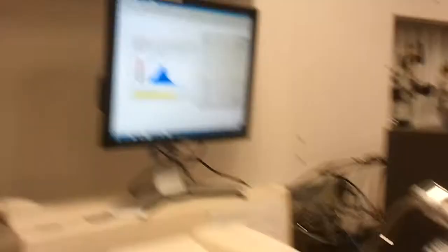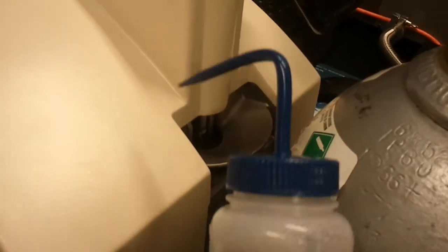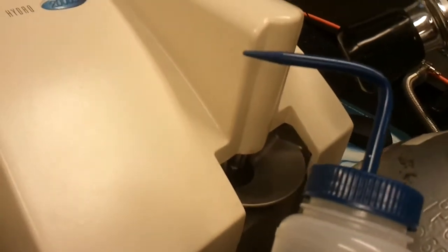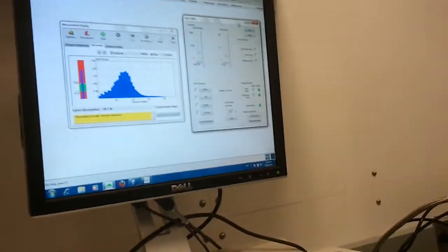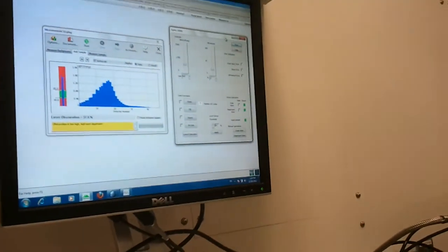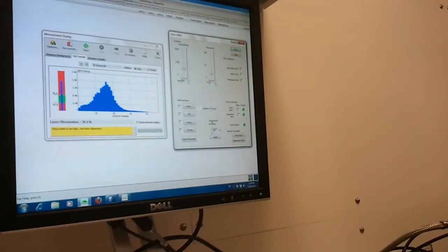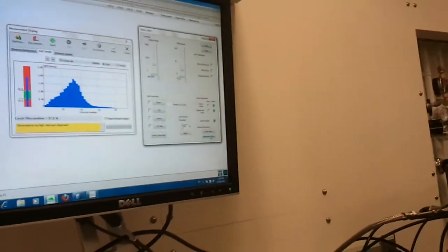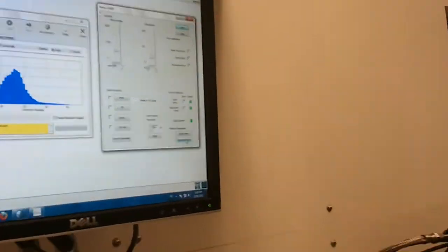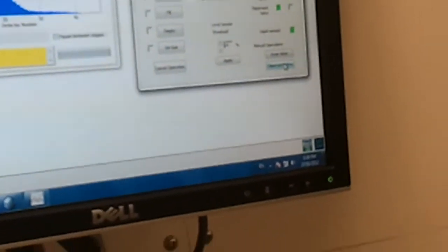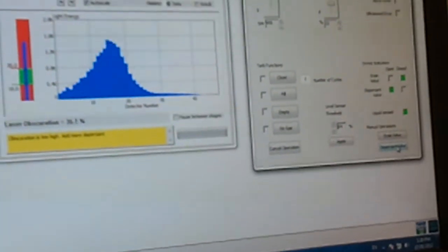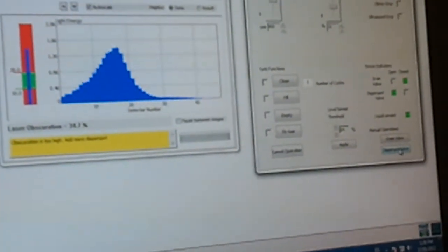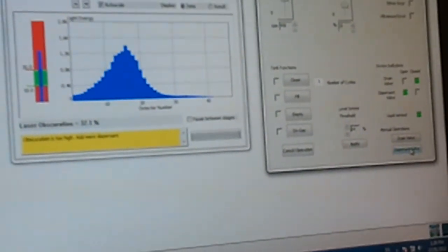So next step is we're gonna clean this, right? When you do it, you're gonna do it with alcohol. This is DI water. So any particles are here it will no longer be entering your system. And now if it happens to you, in this case you can disperse. It means adding more water to it, and the excess water is just flushing away. So when we come back to the green, you just shut the dispersant valve off.